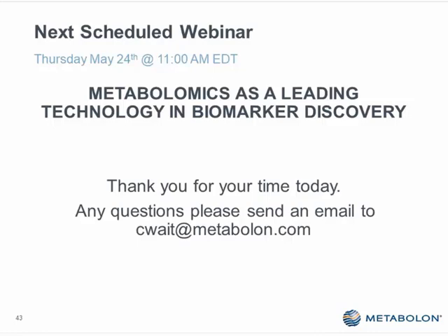Our first question is from Ryan. Are these platforms standardized for whole blood analysis, or typically limited to plasma or serum? We can use the whole blood, plasma, or serum. They're pretty interchangeable. We can also use dried blood cards. So all of those are available, and we have a lot of experience with all those different sample types.